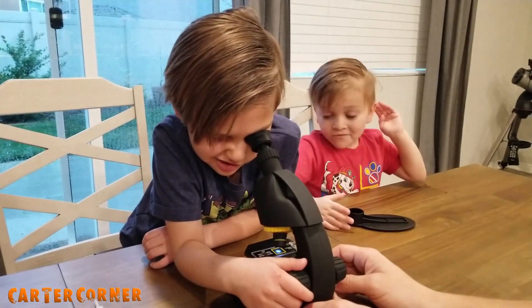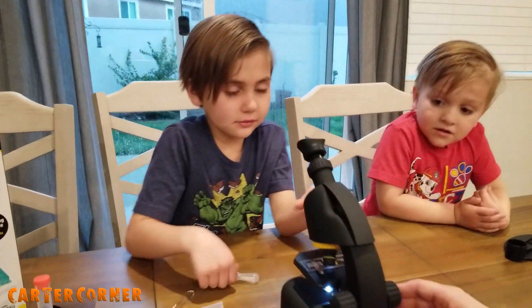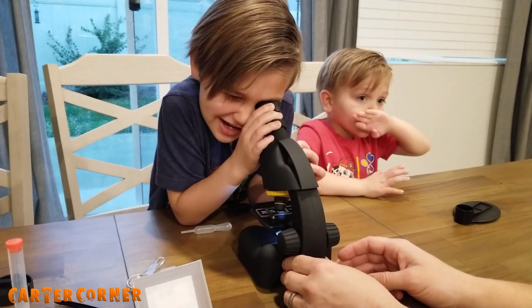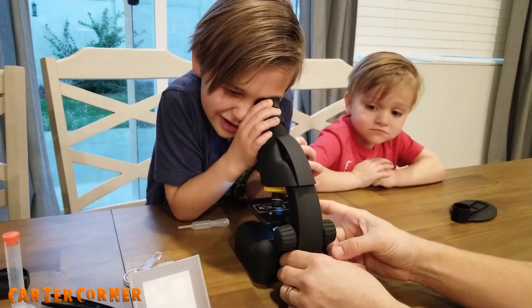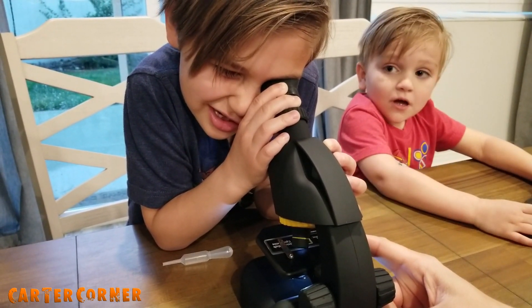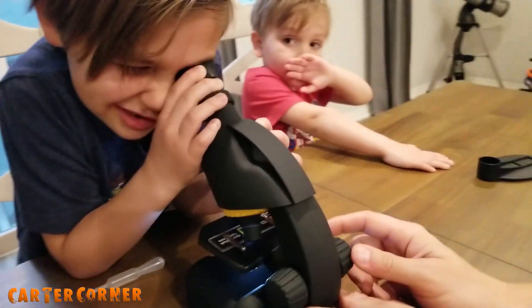Do you see anything? Just light. Do you see the onion? A little bit. Now look. You see it now? Here, let's go a little more zoomed in. I see a bunch of detail. What does it look like? Kind of like a forest. Now we're going to turn it to ten times magnification. That was four times. You might have to adjust it a little bit more. You see a pattern now?